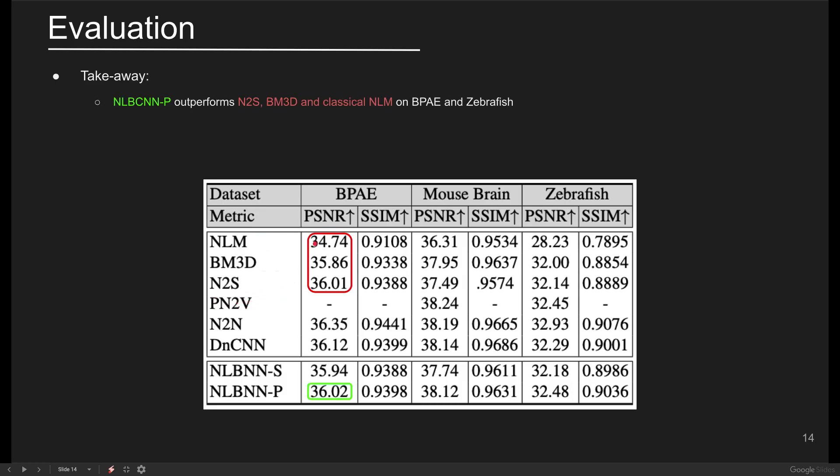For the BPAE datasets, NLBCNNP outperforms non-local mean, noise-to-self, and BM3D while lagging behind the noise-to-noise and noise-to-true methods. The red and green boxes show the loser and winning methods respectively.